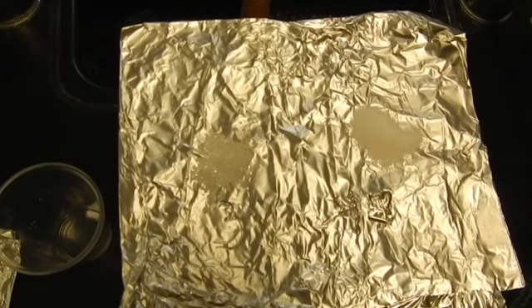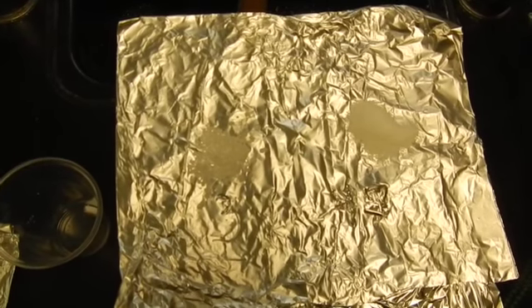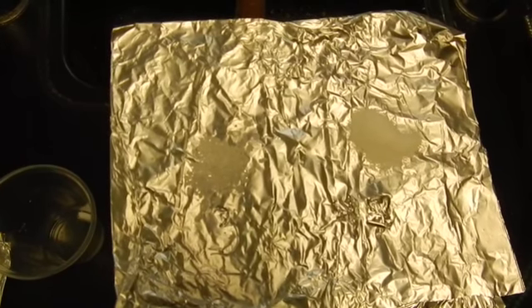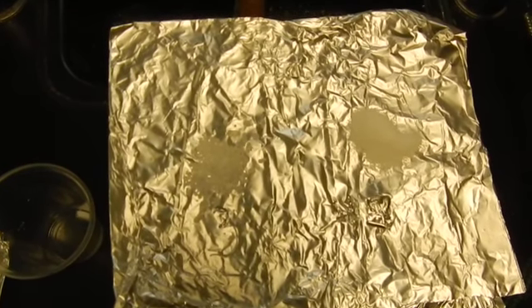So you can see number 3 is actually already melting and bubbling, whereas number 4 is not really having much of a difference at all.